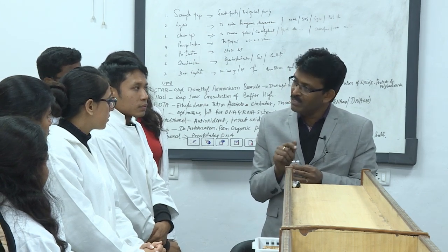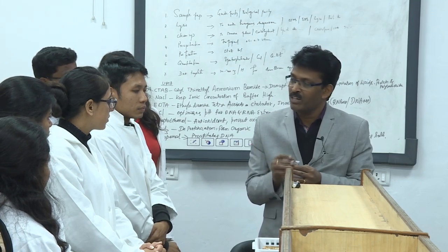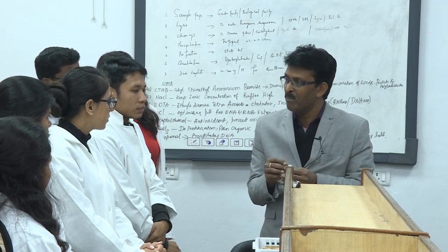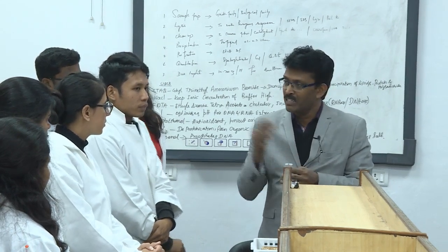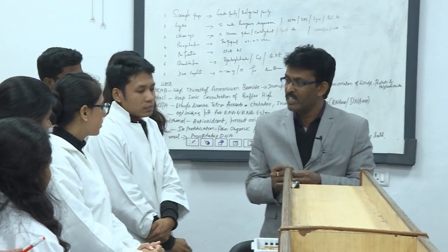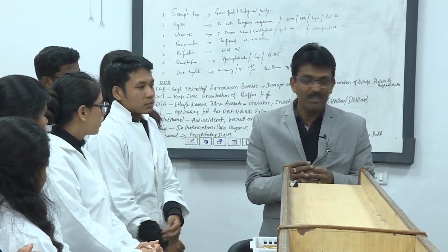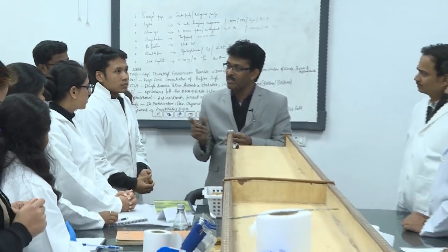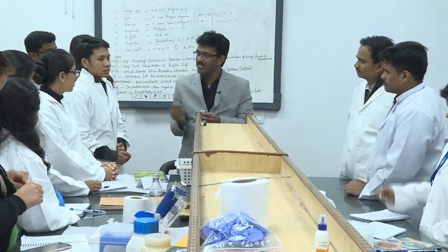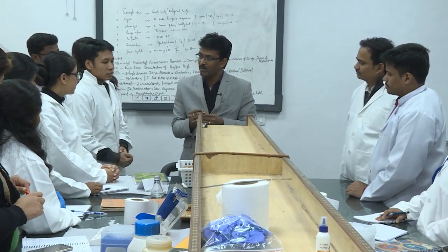So, here comes the coding system. This takes Bacillus subtilis, or B underscore ALM, right. Maybe another sample you collected from, let us say, Srinagar, right. You give a different name. It may be RB underscore, maybe you give some name, maybe SN something for Srinagar, so that you know this isolate is from a completely different location.